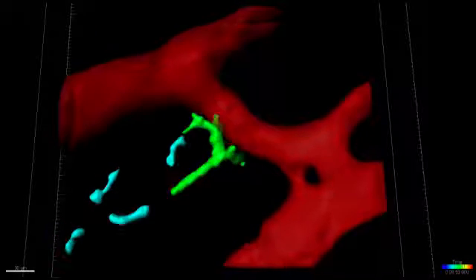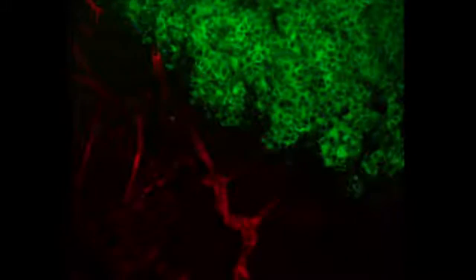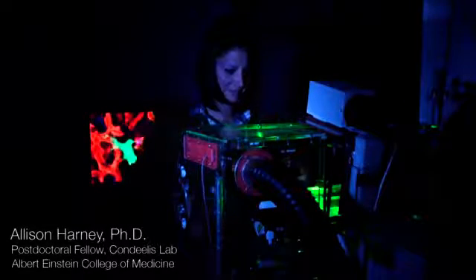If I told you that we make movies, you might ask what genre? Horror, action, thriller, war. They'd all be accurate, because we can see in real time how individual cancer cells spread within living tissue using high resolution microscopes with specially tuned lasers.